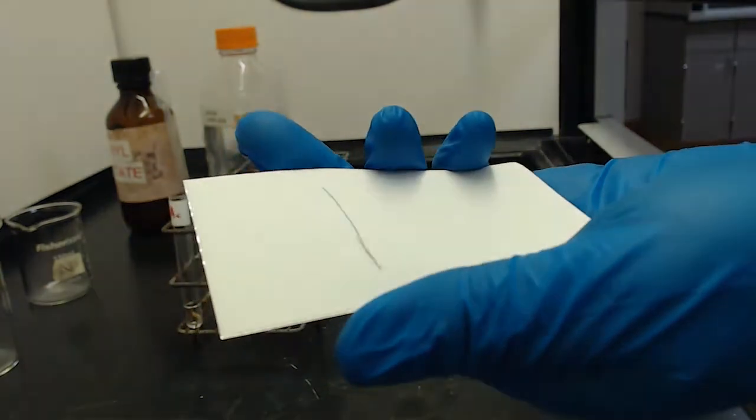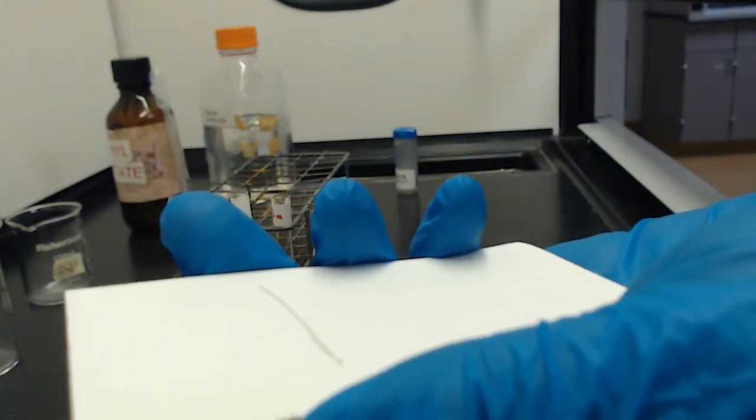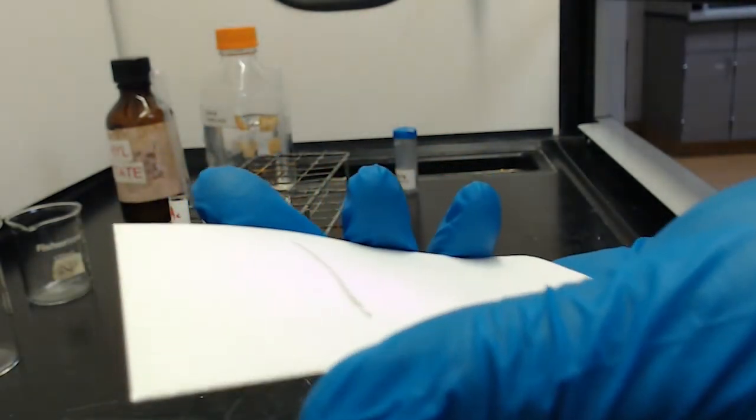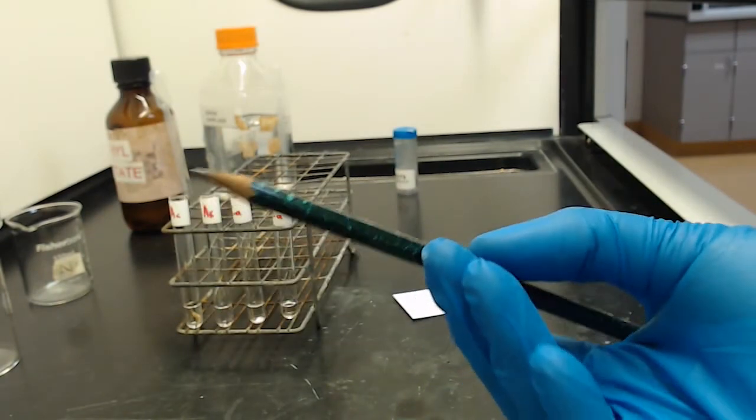You see that? I scratched the surface there. I'm not sure how well it's showing up on camera, but I actually made some of the silica gel come off of the plate here. So to avoid that, you want to draw softly with a dull tip pencil.